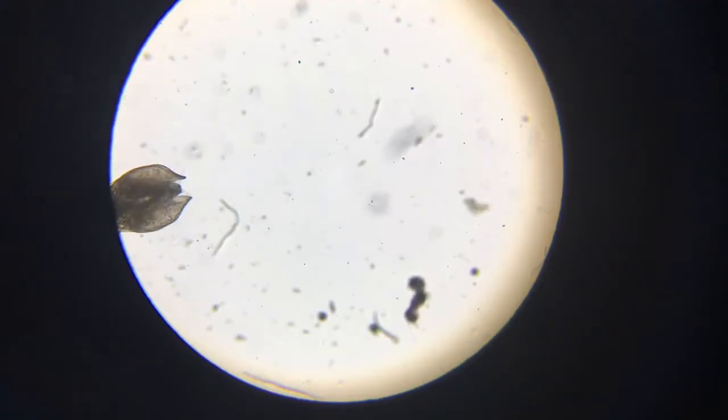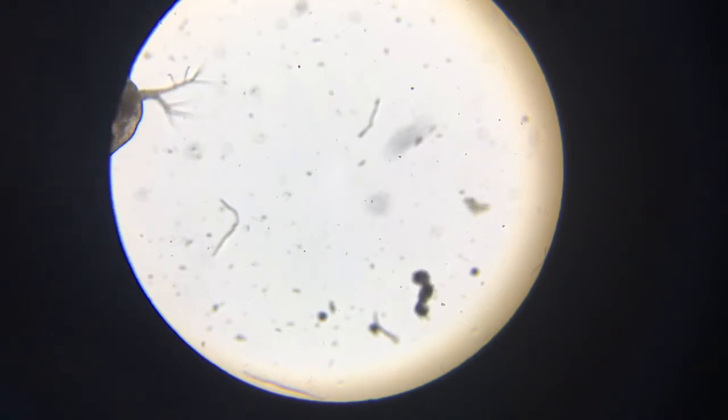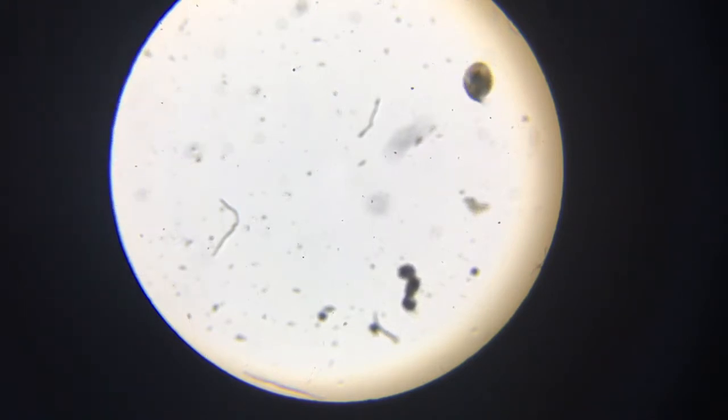And here are those same organisms but in a clump of algae. This clip is not a time lapse. These organisms are really moving this fast.